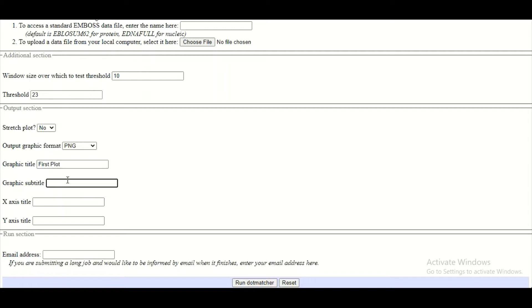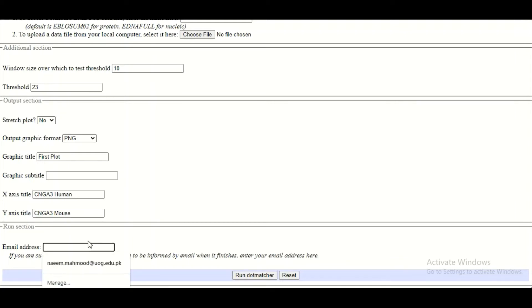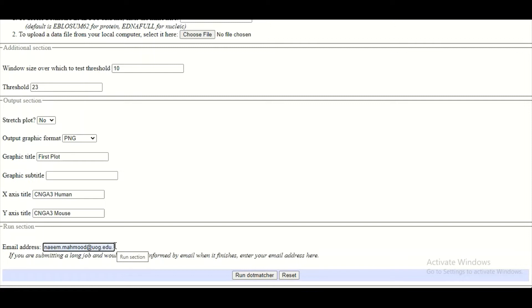What graphical subtitle do you want to give to your plot is up to you. What is an x-axis title and what is a y-axis title — let's assume I'm going to give CNGA3 human on the x-axis and CNGA3 mouse on the y-axis. We can also give our email address in this box and when the job is completed I will get a notification. But this information is not mandatory — it is optional. If you give the email it will be good, if you don't give the email then it's also fine.